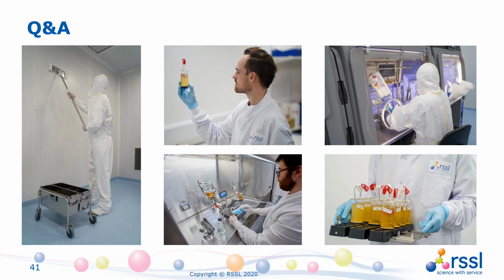It might be you've got a problem with the HEPA filter, or you've got a problem with transporting materials, or you've got a problem with the way or the frequency that people are actually applying the disinfectants. But you equally could have a concern. So you should keep reviewing. How often you might do one of these reviews is debatable. It might be 6 monthly or annual, but it's regularly coming up with what are the most common isolates. If they're overwhelmingly gram-positive cocci, then virtually every disinfectant should be able to treat those. If you start to see other organisms, then it's at least signalling that you need to take some kind of action, which might be the disinfectant.